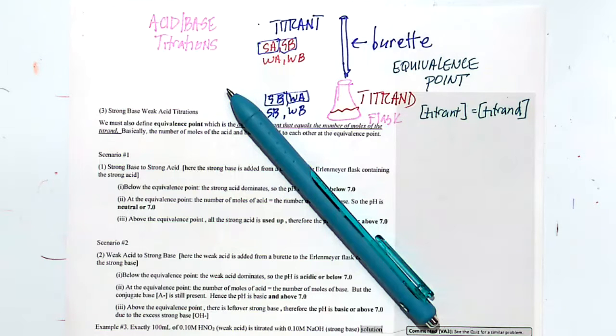So let's fill this up. This goes all the way up to 50 mLs. So this is your standard acid-base titration. My sodium hydroxide is a strong base.